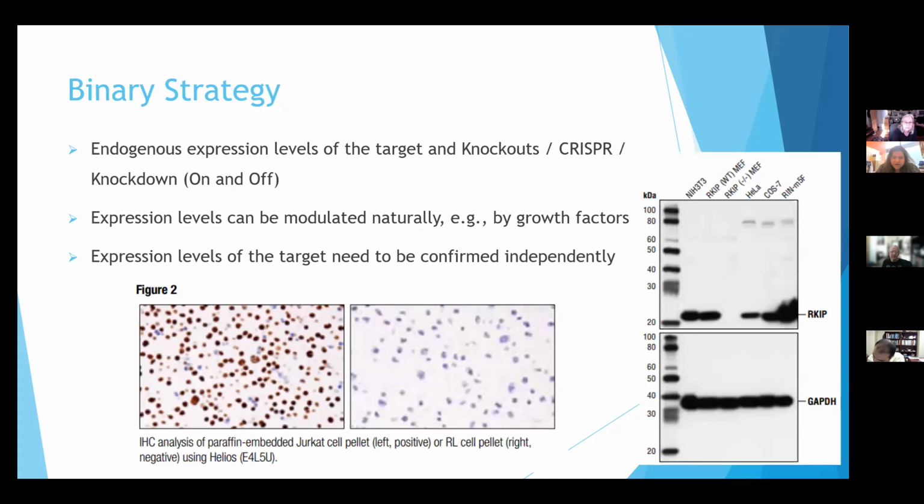Sorry, I'm touching my pad, but it's not present when it's knocked out. So this is a much cleaner result, and that antibody has now been validated for MEF cells in Western blot. Okay. And one would hope that would be true also for other cell lines, right? So now you're like 10 steps ahead for another cell line in Western blot. It's very likely that that will work.